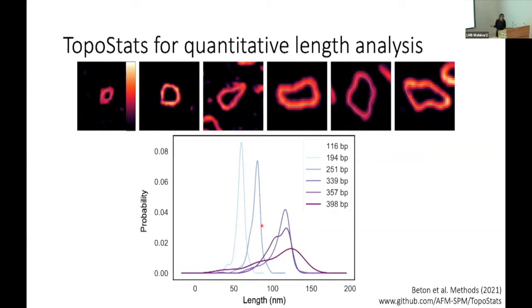And I have a backup slide where I can explain why we get second bad peaks on this, but it's to do with weirdnesses in annealing oligos together.